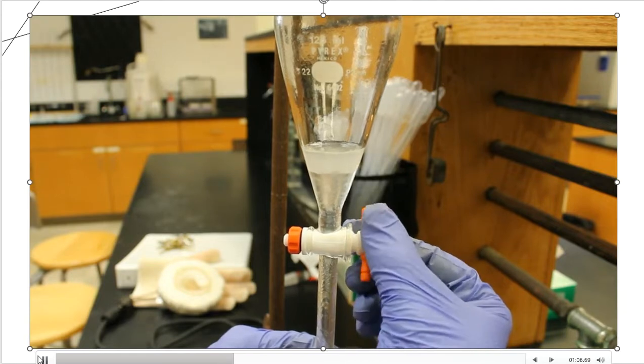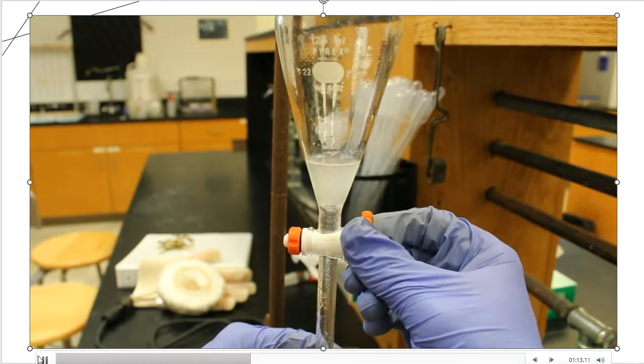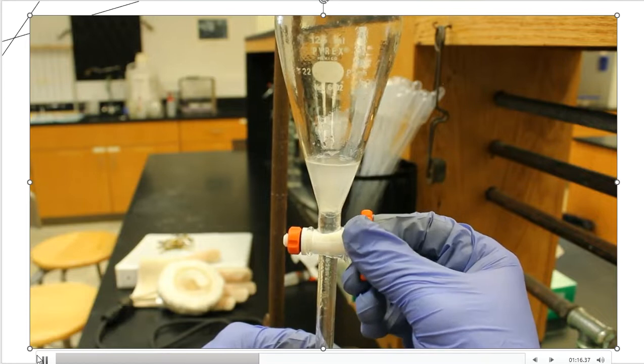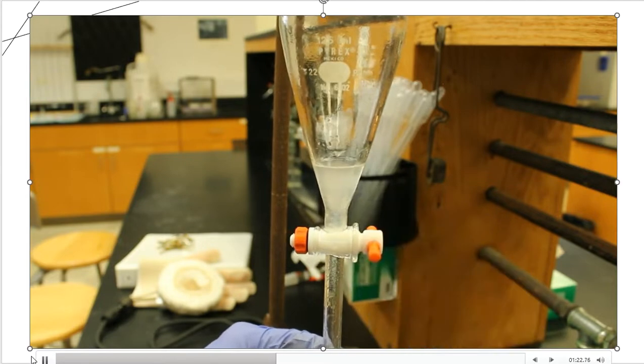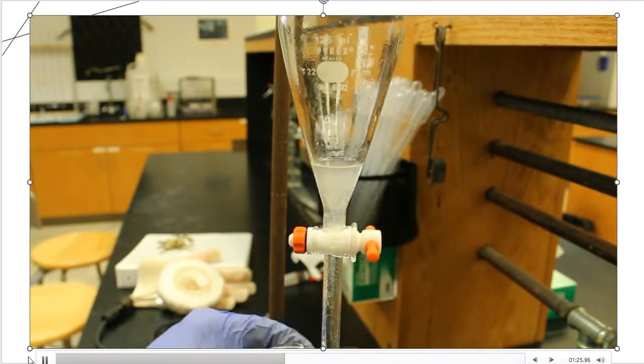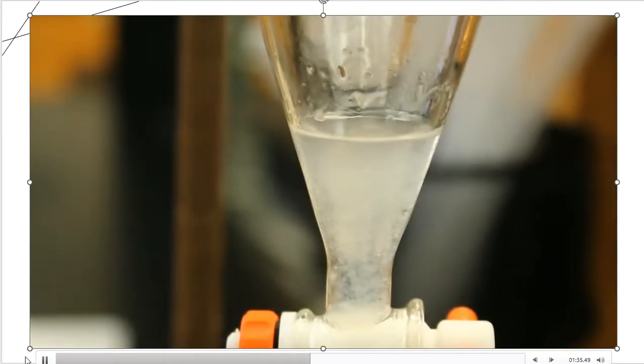All right, so as I get closer to the tapered side, you're seeing that the layers become a little bit more developed as far as separation goes. And I'm just going to slow down on the drips at this point. I'm going to allow that to go through the stopcock, and we'll cut it off at that moment. Notice here I'm seeing a lot of cloudiness that's forming. If I zoom in maybe a little bit, you're seeing some of that floaty looking material in here, and that's pretty normal. Sodium hydroxide is doing what sodium hydroxide does. It's getting rid of some of these byproducts that we don't want and helping to make sure that we get a very clean organic product at the end result of this.